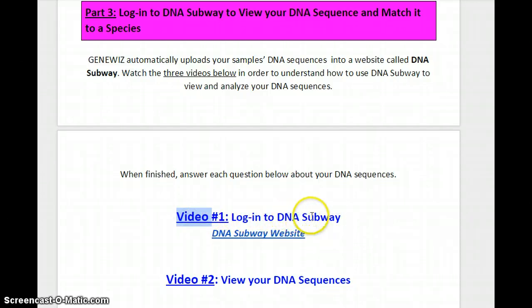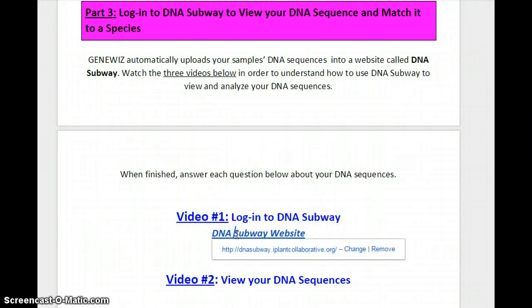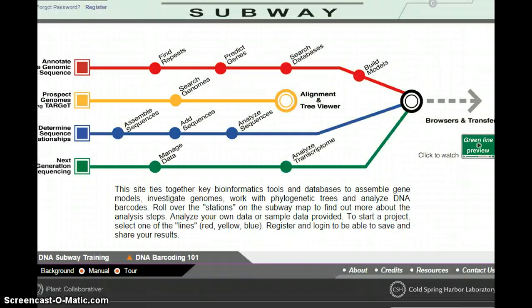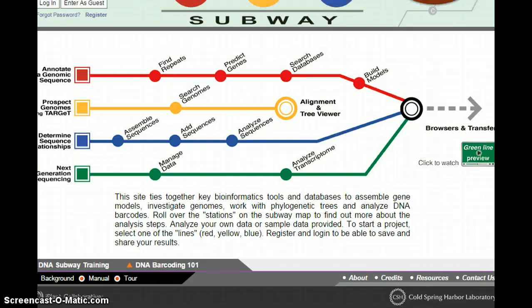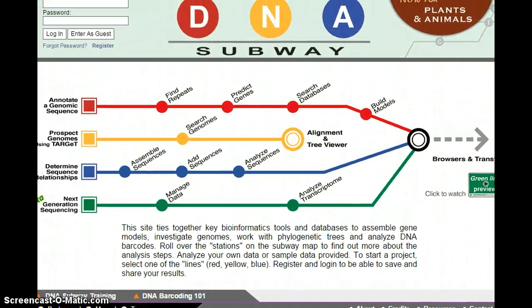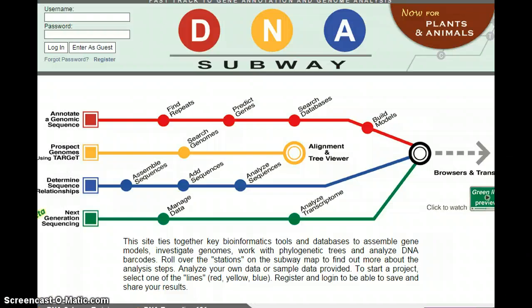To get to the DNA Subway website, you want to click on this link here that's provided for you in the Step 7 document. When you click on this link, this is what you should see. This is DNA Subway's website. Up in the left hand corner, you'll see a button that says 'Enter as Guest.' Go ahead and click that button.